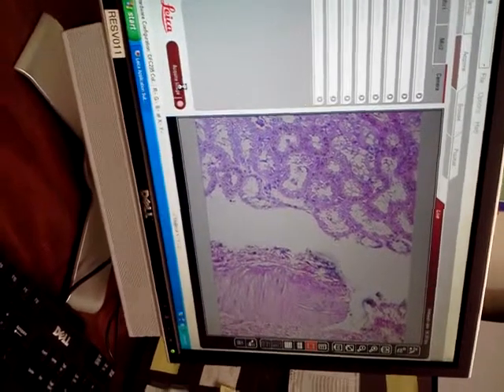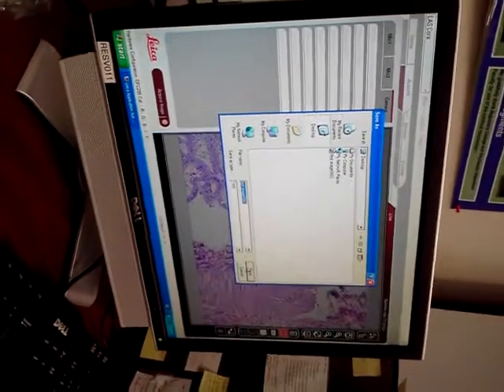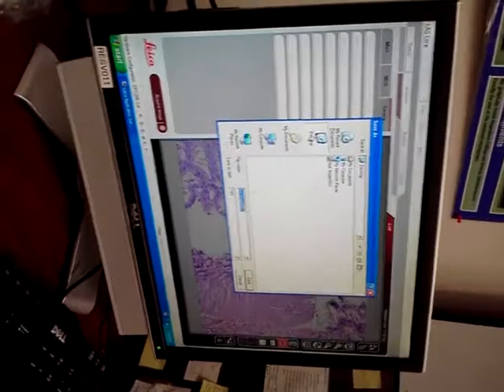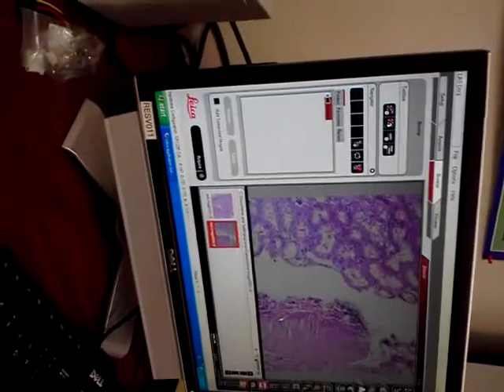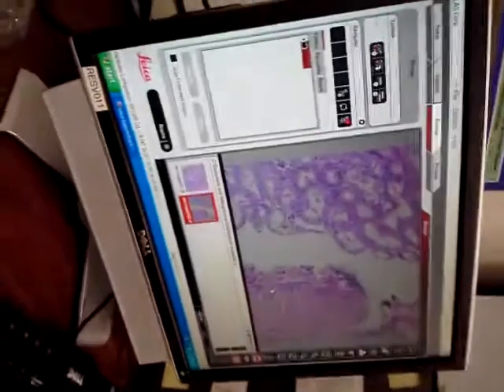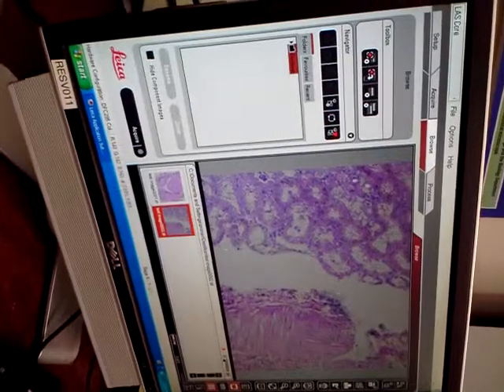Can you put a little image? I'll do it after, I'll show you. That's in the post processing. So I'm going to save it just on the desktop, because it's got all the information attached to this. Whenever you capture an image and you find it on your computer, there's going to be an image file and there's going to be like three other information files. Keep those. So here's your image right here.